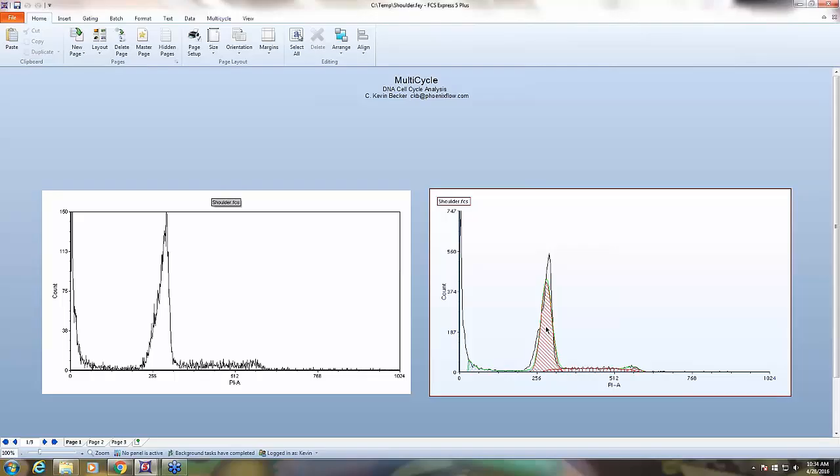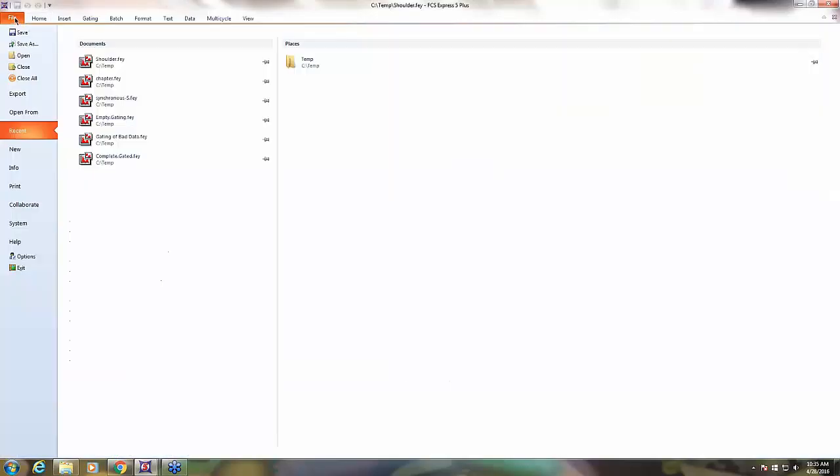All you can get from cell cycle analysis when you're looking at apoptosis like this is, yes, I do have some apoptosis, but I need to go to another assay, an annexin V assay, a TUNEL assay, some other assay where I can do a better job of pulling out my apoptotic cells and getting a measurement of what the percentage is. So don't look to cell cycle analysis as your solution. I know it's fast to do apoptosis that way, and it's cheap, but it's not reliable.